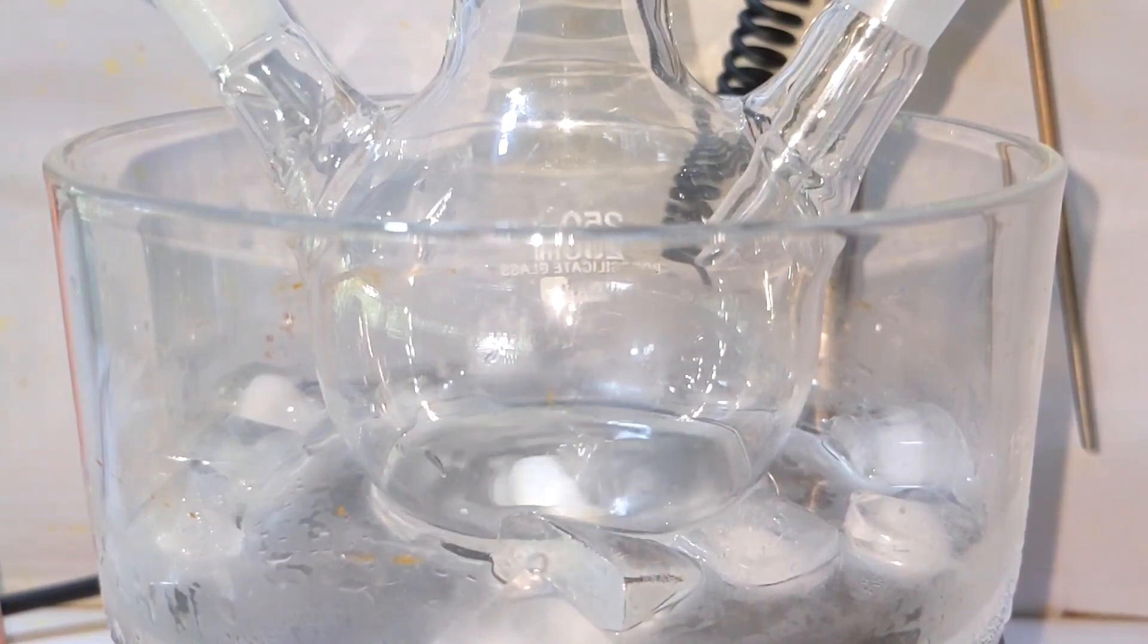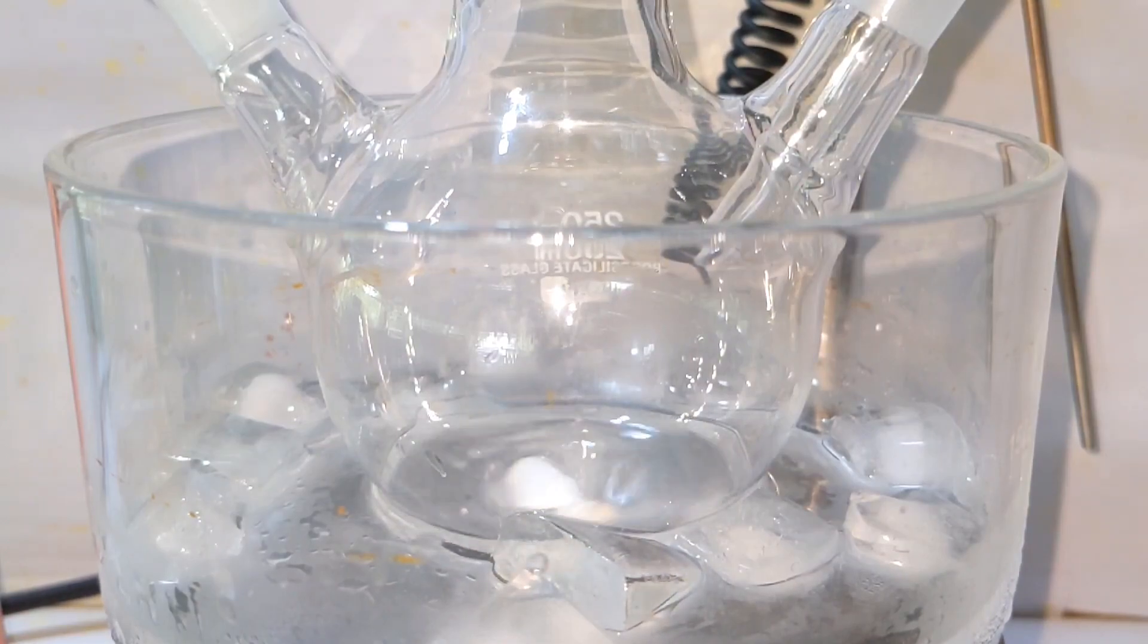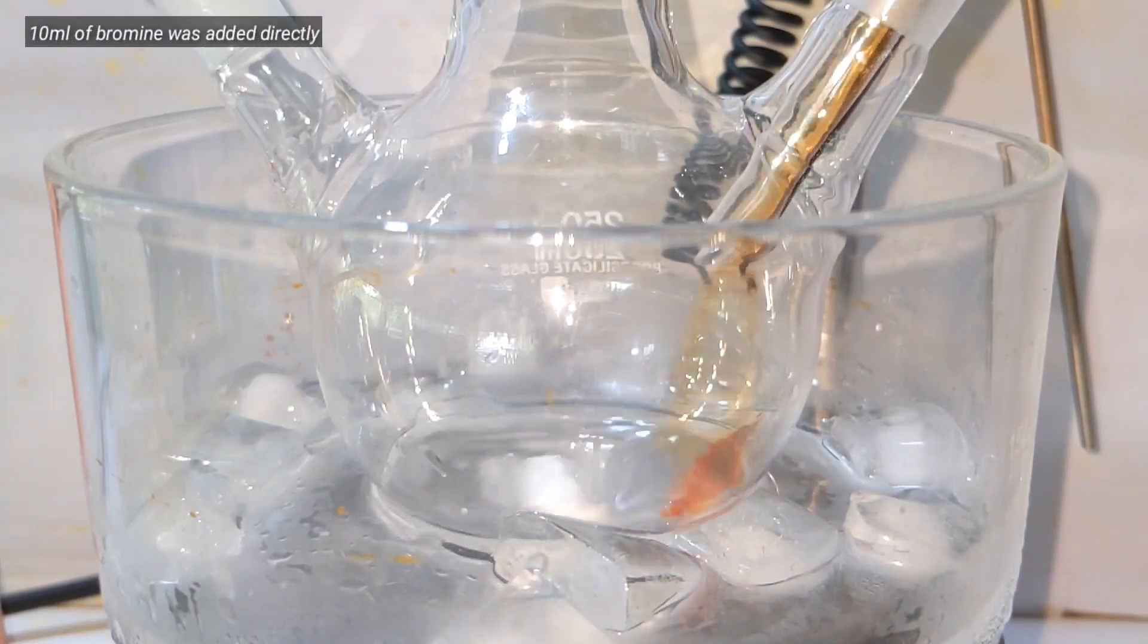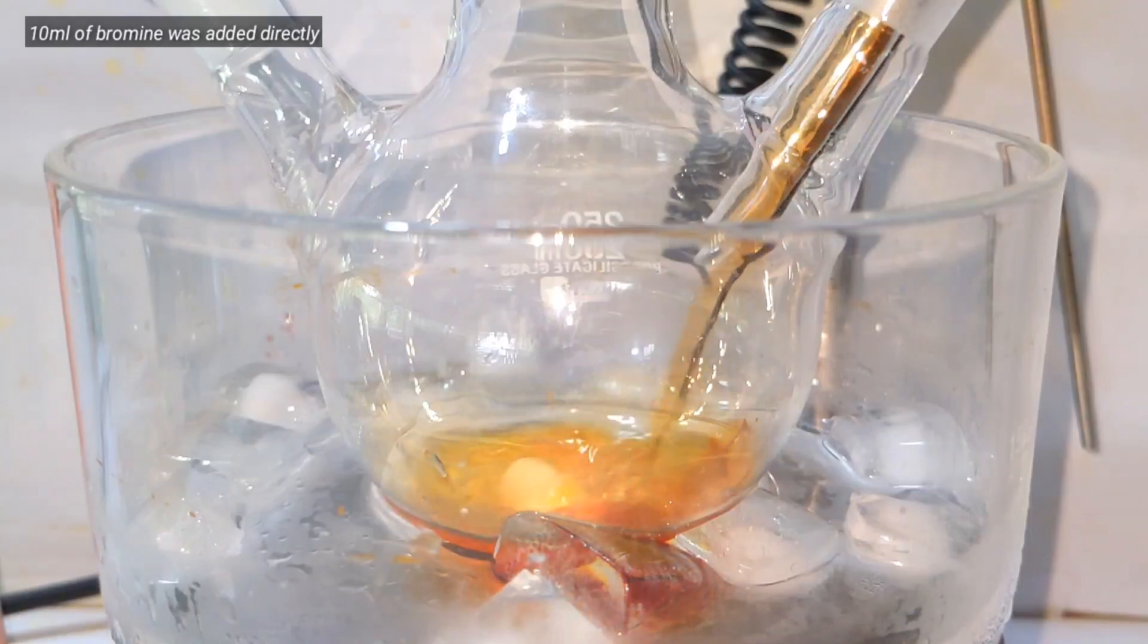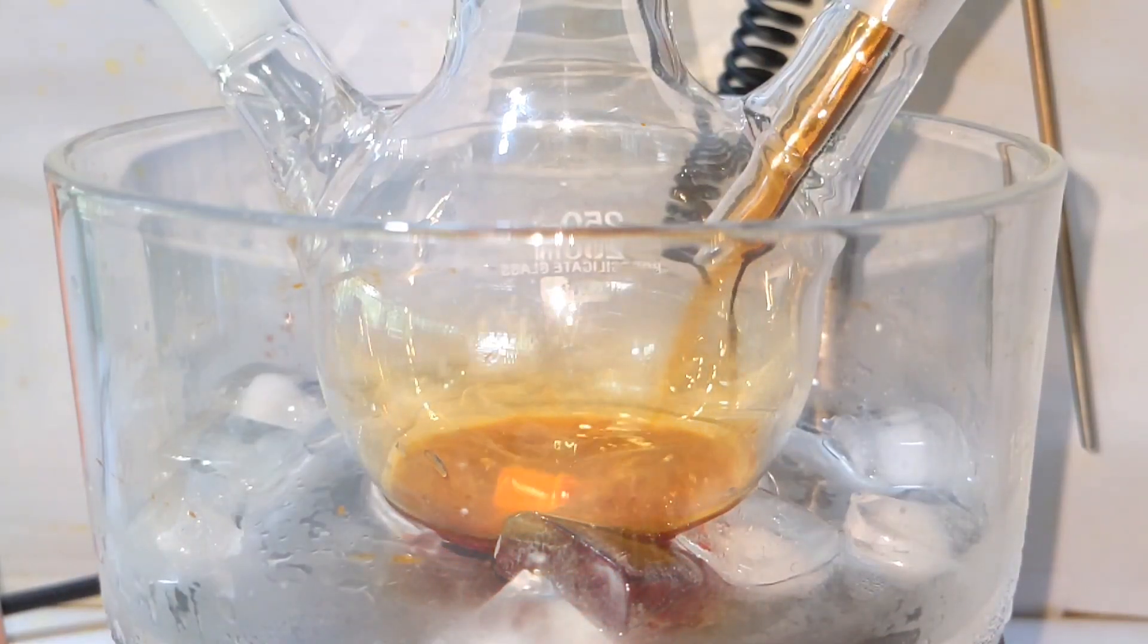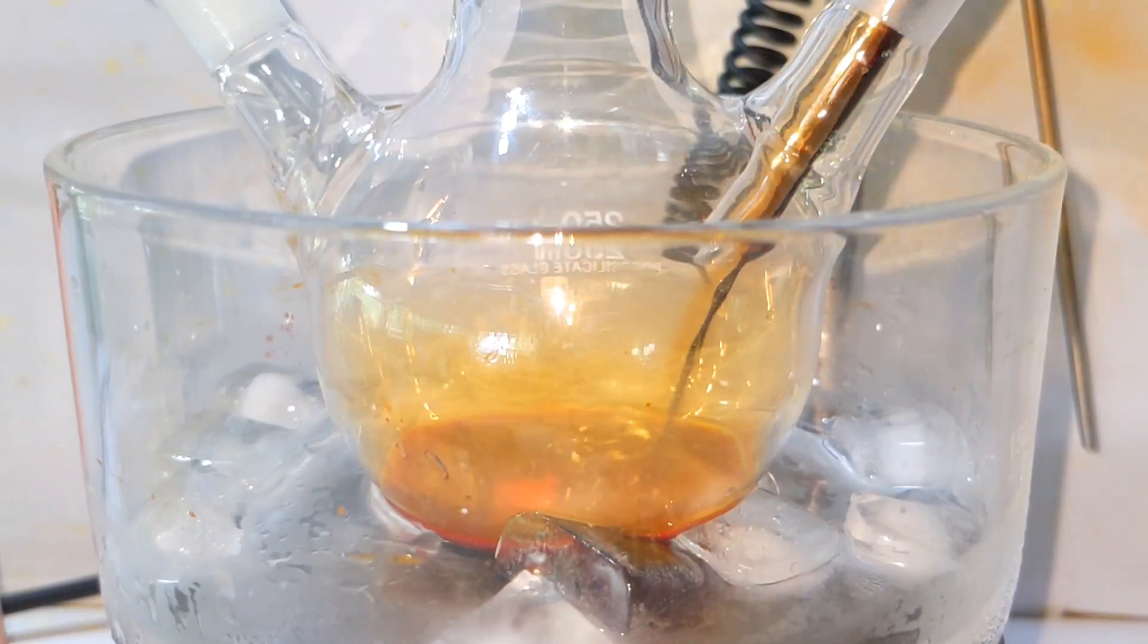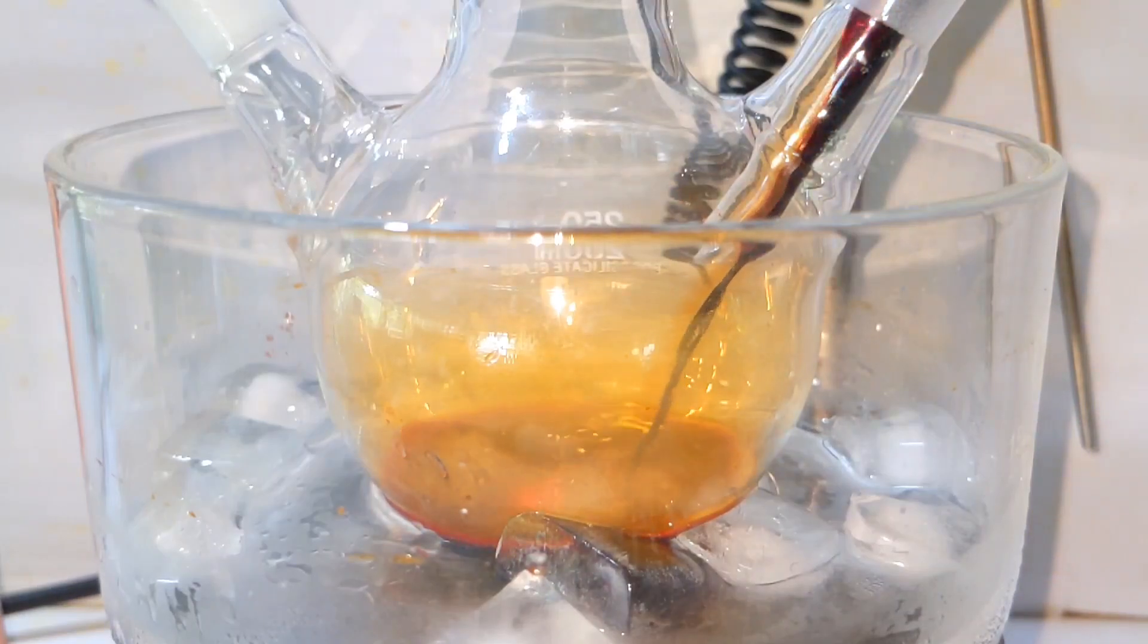With constant stirring, slowly add the 10 ml of liquid bromine measured in a graduated cylinder. The reaction soon commences and is exothermic. An ice bath will help prevent much of the bromine from vaporizing and creating an environment of bromine.